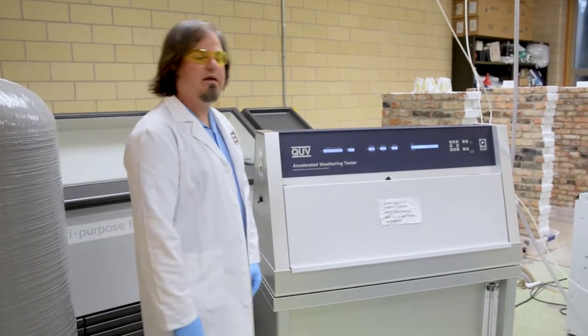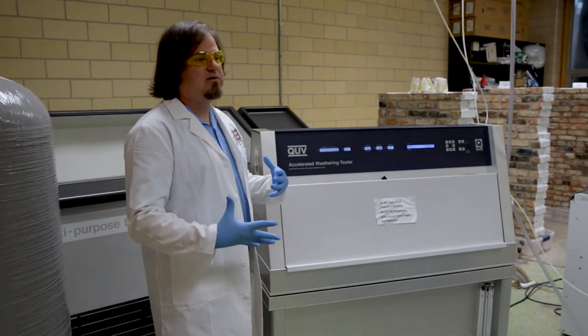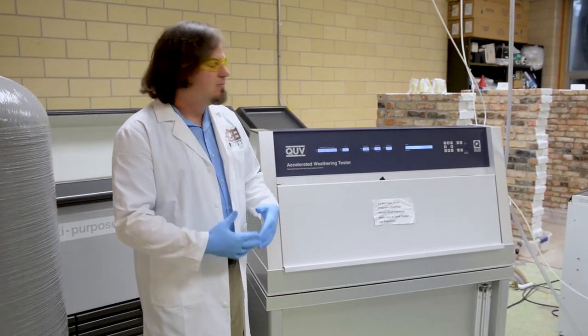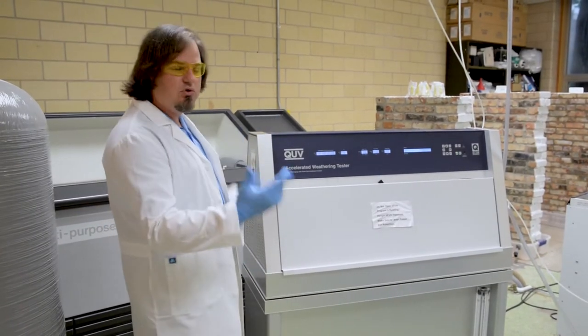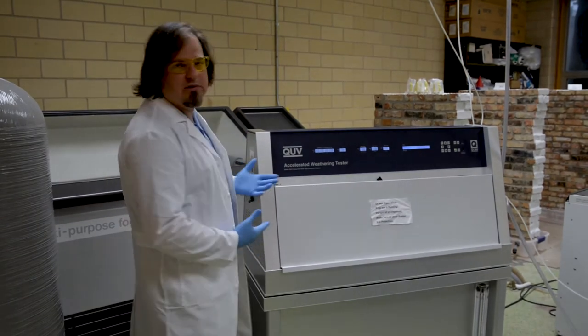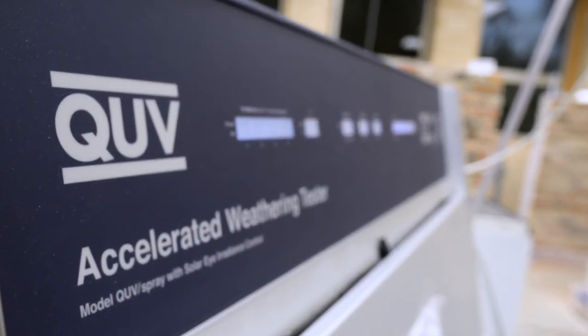Welcome to the weathering lab here at NCPTT. In this lab we have various instruments that we use to do what we call accelerated weathering. This is a QUV weatherometer — we have two of them here at NCPTT. Basically what this instrument does is it accelerates natural weathering.